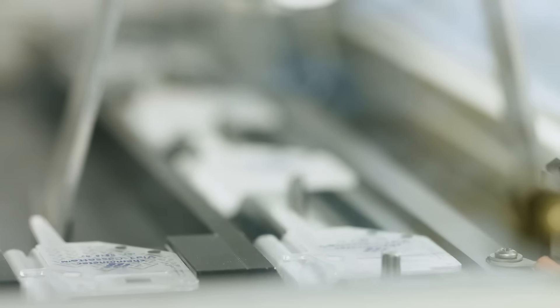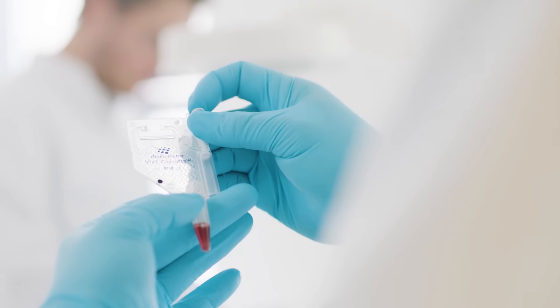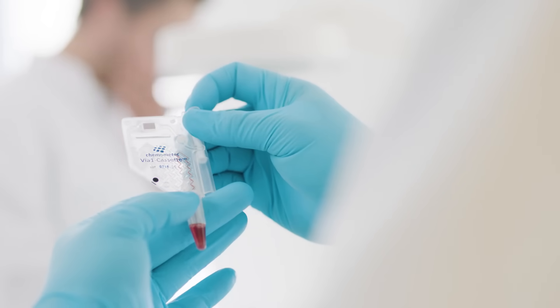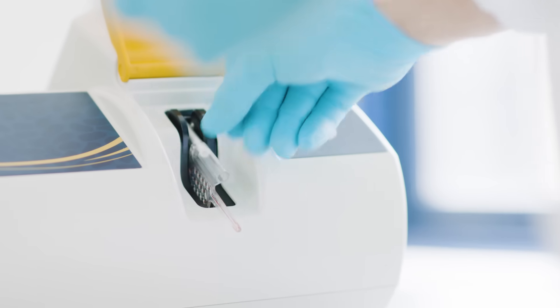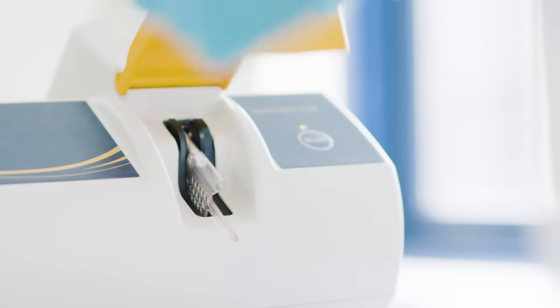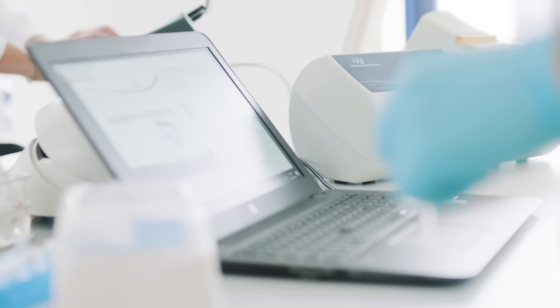They enable a growing range of analyses to be performed in situ, providing clear, consistent data.